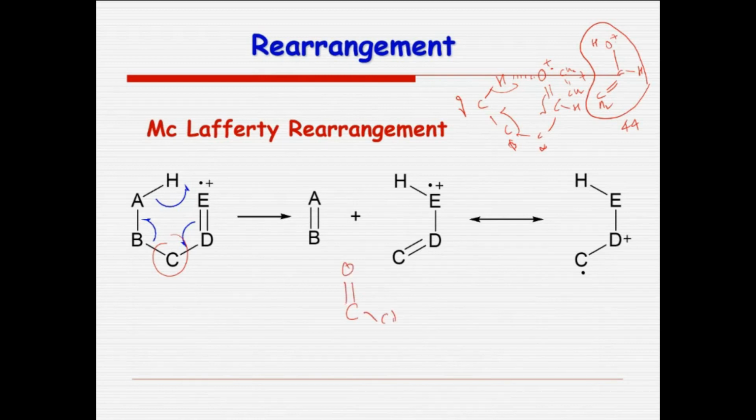Now suppose, for example, I am doing 2-hexanone. I want to know the McLafferty peak for 2-hexanone. So I'll have CH2. I'll check whether I have gamma, alpha, beta, gamma hydrogen. And this is the molecular ion.